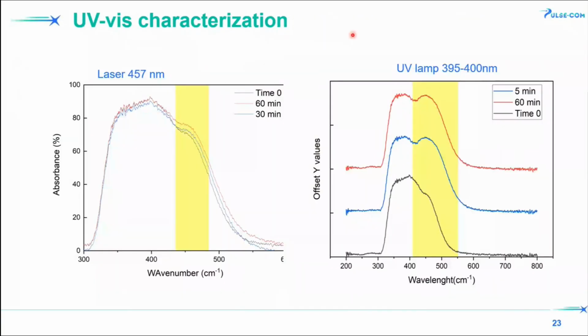This is another experiment that you can do with the spectrophotometer. For example, if you want to know how your azobenzene is absorbing in the matrix that you prepared, you prepare a PMP without azobenzene and use it as a background reference. You will then have just the absorbance of the azobenzene inside the matrix.